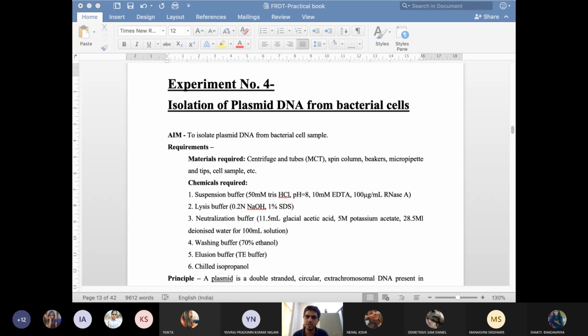So as I mentioned, introduction of the alkali makes them single-stranded. So simple thing, you will say, sir, remove the alkali. If you remove the alkali, it will become double-stranded again. So how to remove the alkali? How can we remove the alkali?